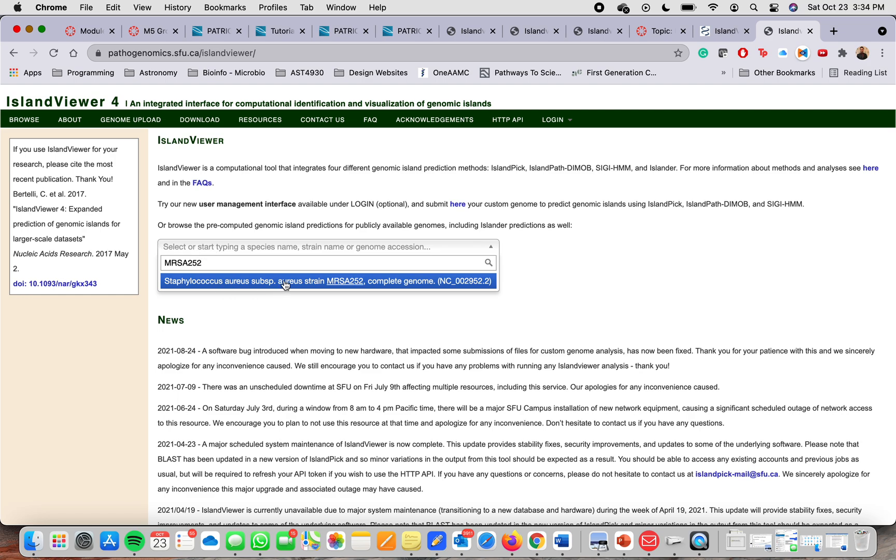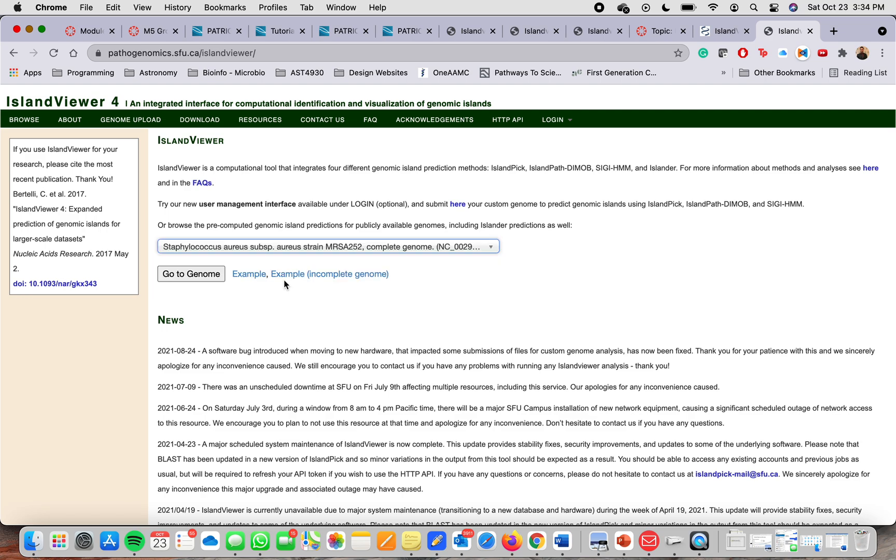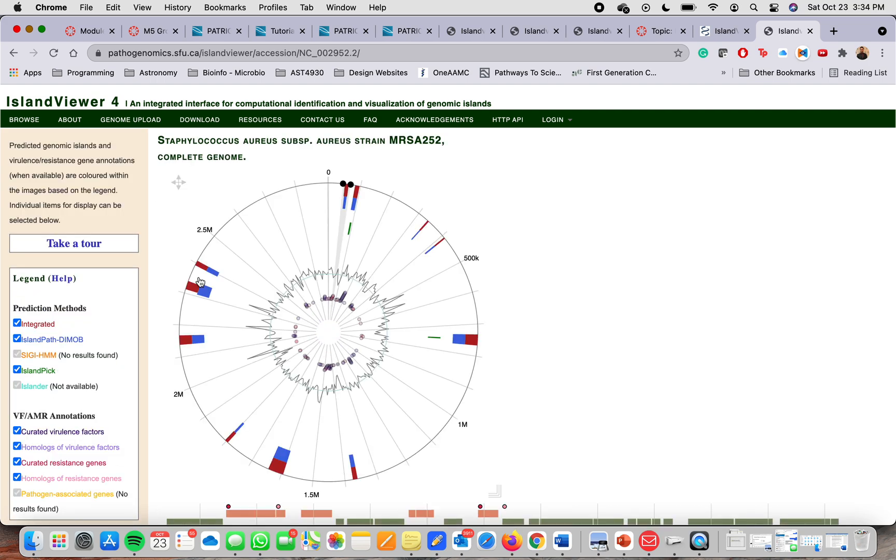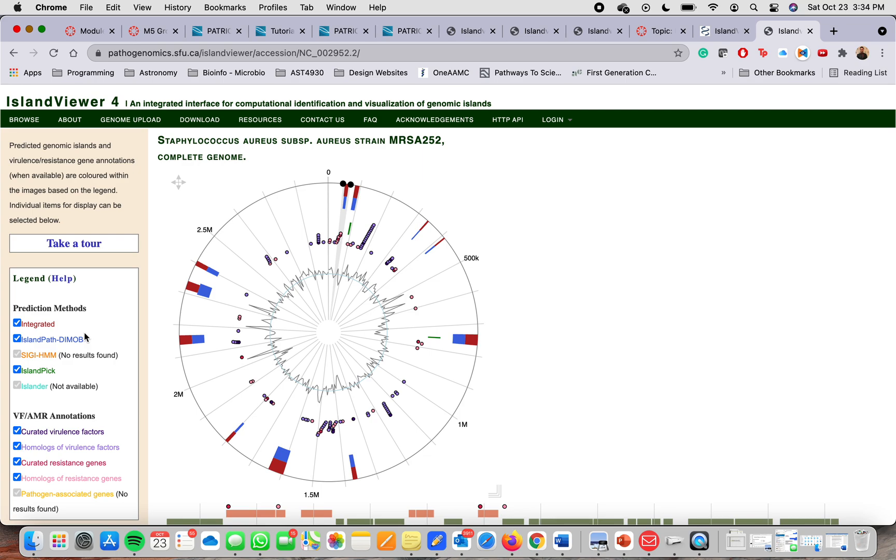You should be able to click on that and then press enter or just go to genome and it will show immediately a visualization of the genome with different prediction methods.